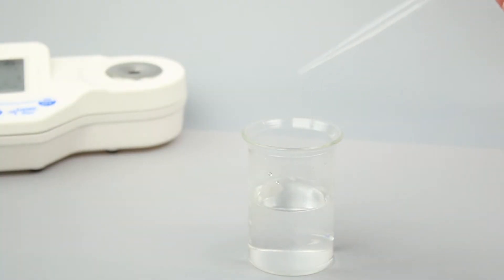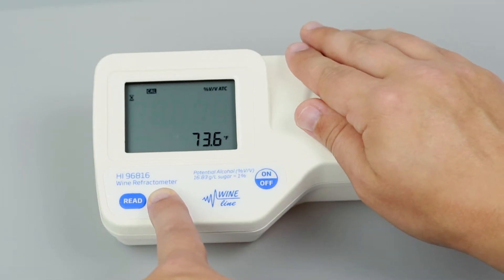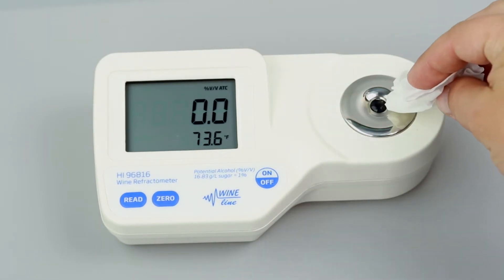Calibration is essential for refractometer operation and takes just a few seconds. We recommend calibrating before each use. To calibrate, fill a plastic pipette with deionized water and cover the sample prism with just a few drops. If there's a strong light source nearby, cover the prism with your hand. Press the 0 button. Once 0 appears on the screen, use a soft tissue to absorb the deionized water off the prism.